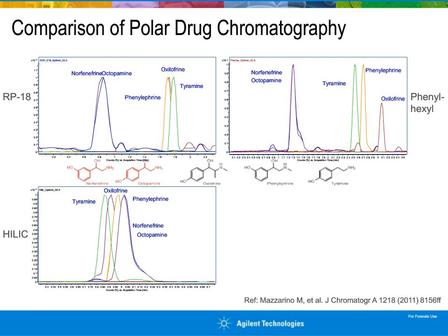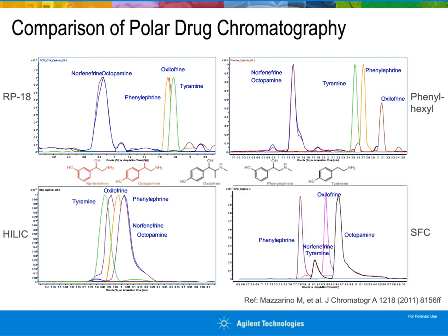And if we look at this on an SFC, you can see that it is well separated on an SFC. The first 3 pictures here have been reproduced based on a paper from the Doping Control Laboratory in Rome. And I used the SFC at a university in Berlin to run the very same compounds to see how this compares.